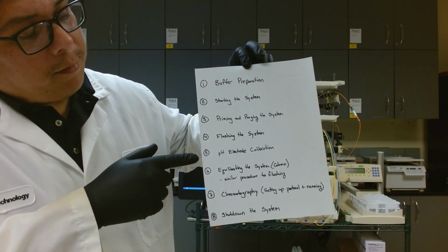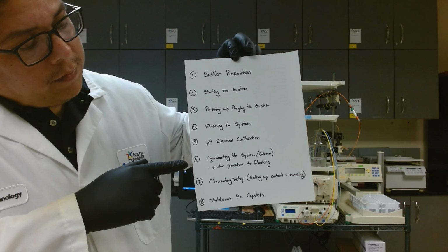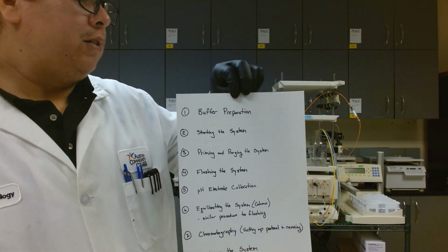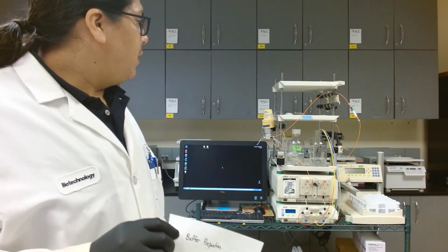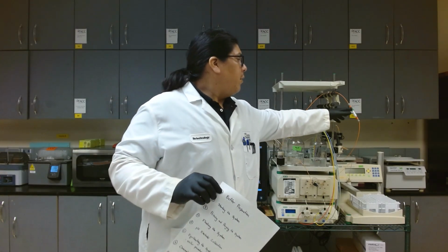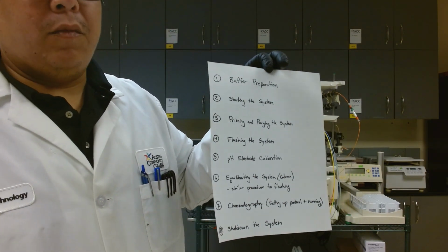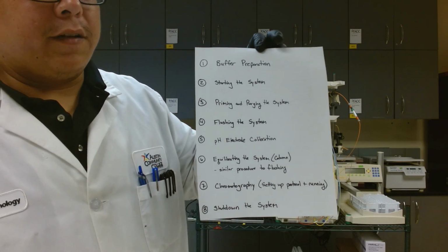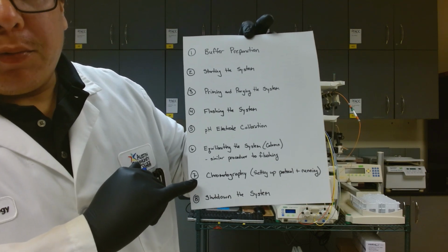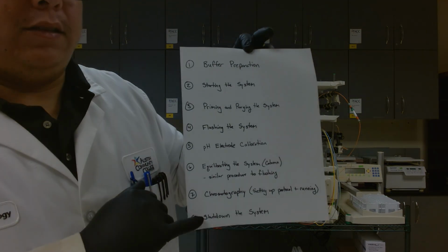I'm going to show you how to find the pH electrode and where in the software you can go to calibrate it. And then once we've done all that, we will equilibrate the system, and specifically we mean the column. So the entire FPLC system is designed to operate around the purification column itself. So everything you see here, the heart of it is the column here. And that's essentially flushing the system with the running buffers you will use for your purification. So once you've got the system equilibrated, then we're going to walk through how to set up a protocol and run a purification. And then after that's done, you'll want to shut down the system.